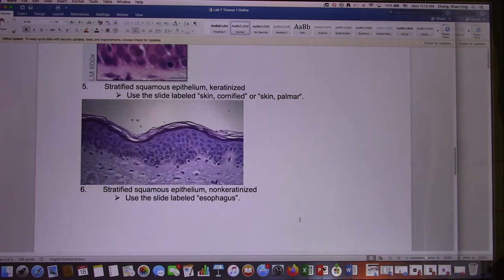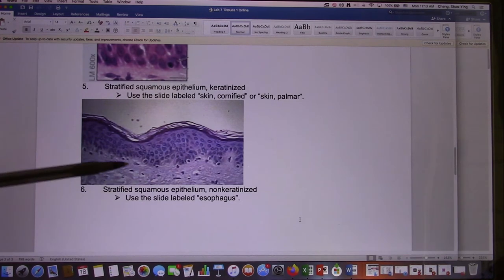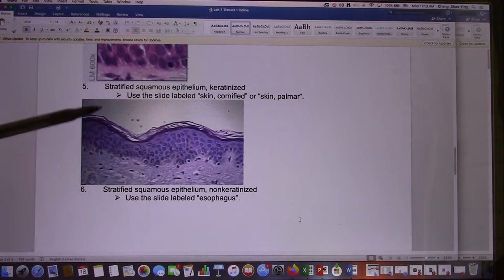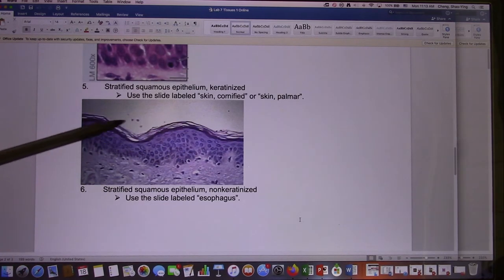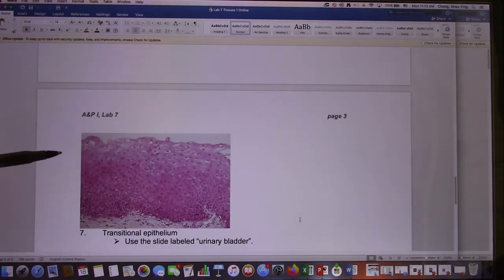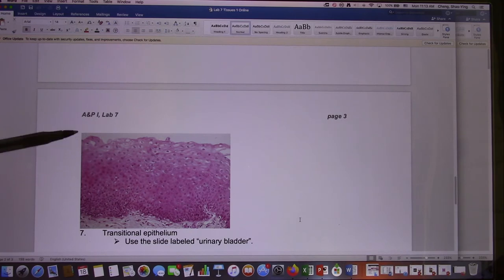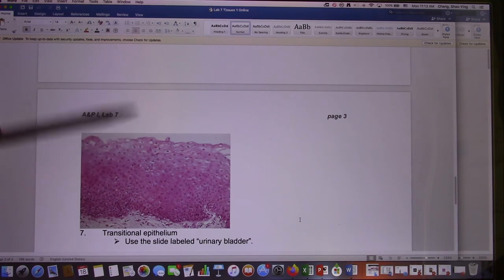Next one: stratified squamous — keratinized. This is your skin. It's definitely multiple layers and they're squamous, and you find they're keratinized. So these are the keratinized squamous. And that's non-keratinized stratified squamous — multiple layers and non-keratinized.